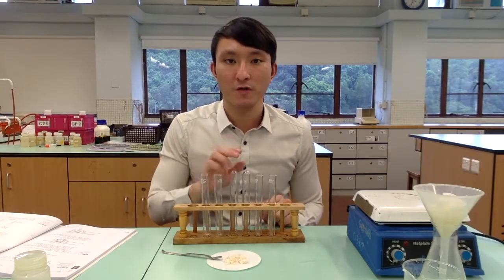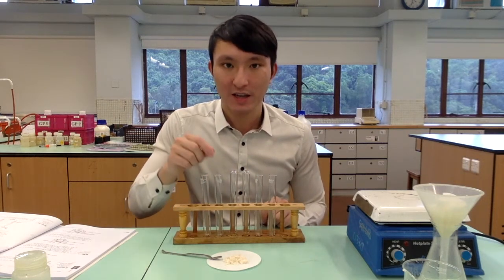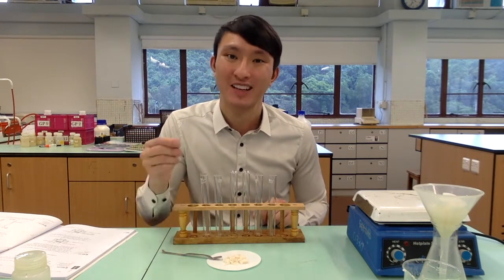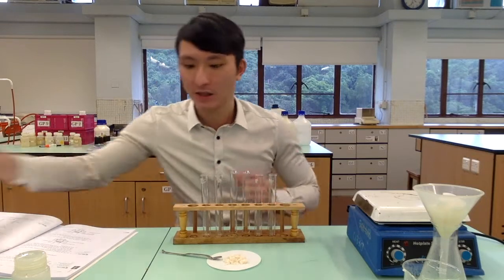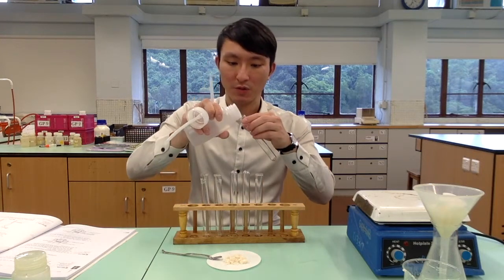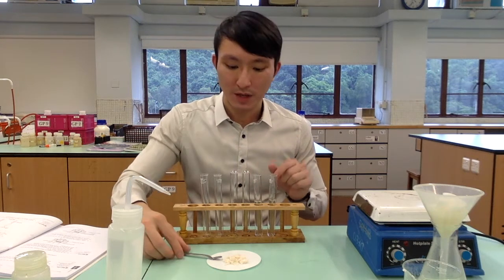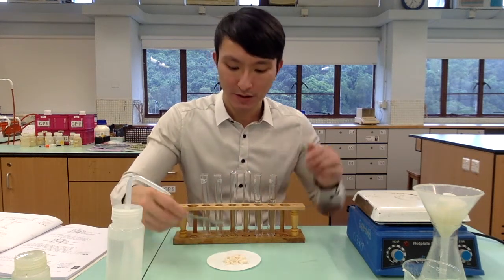Now, we are going to perform two simple test tube experiments to show the wetting property and the emulsifying property, and most importantly, the cleaning property of the soap. So first of all, I'm going to add to two test tubes, each half a test tube measure of distilled water. To one of the test tubes, I'm going to add three spatulas of the soap that we have just prepared.